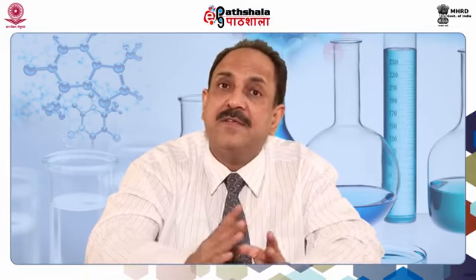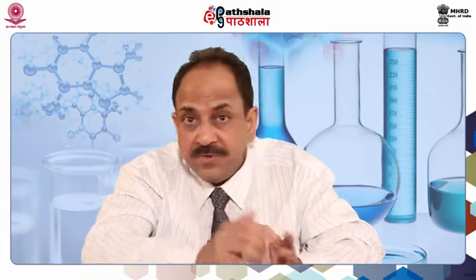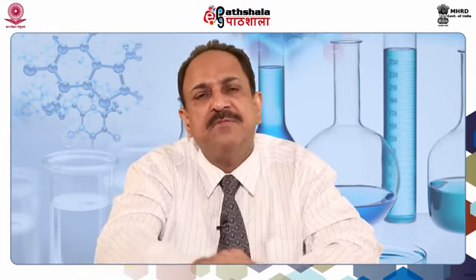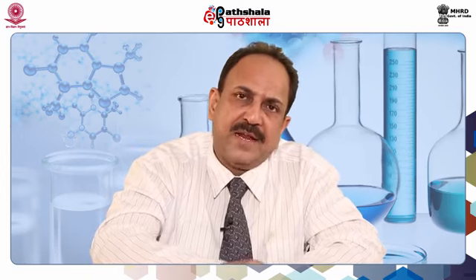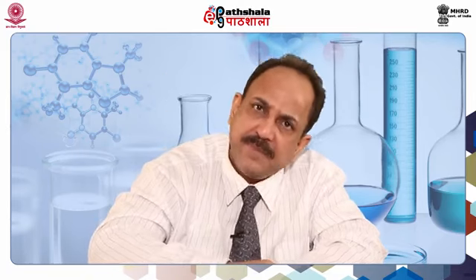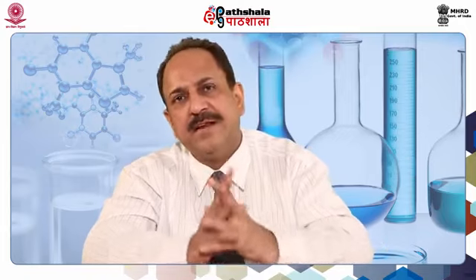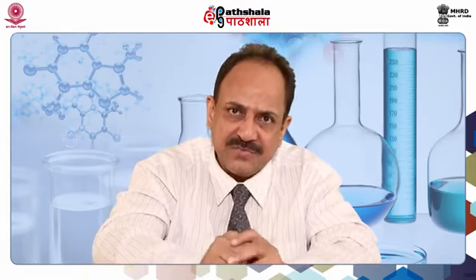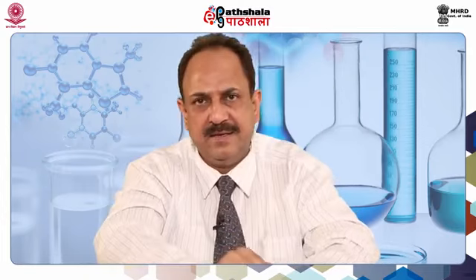At the same time, it offers very good quality molecular graphics as ribbons, as ball and stick, as spheres, as solid sticks. So, this helps in switching between various forms to appreciate different properties of the molecule. For example, when we are interested in secondary structure visualization, we will be using the ribbons form, where alpha helices and beta strands are viewed with ribbons. When we are interested in molecular structure, we will be using spheres for each of the atoms, so that only surface atoms are shown, with various coloring schemes.